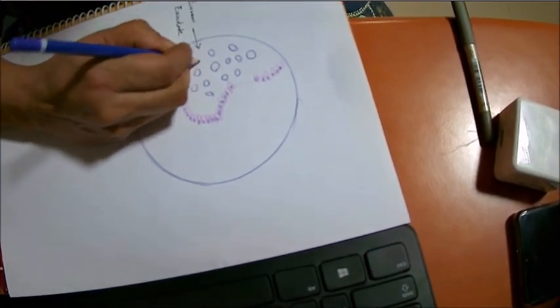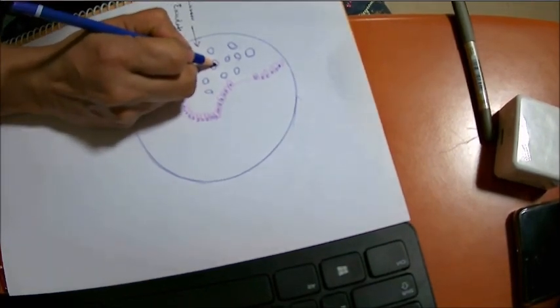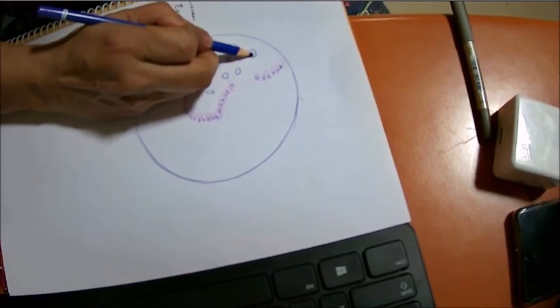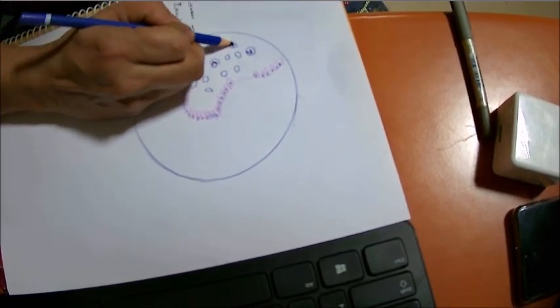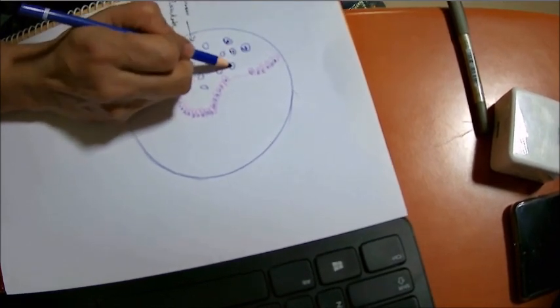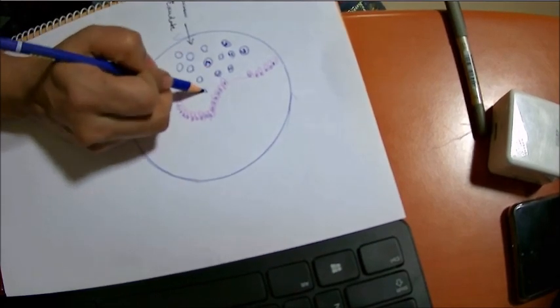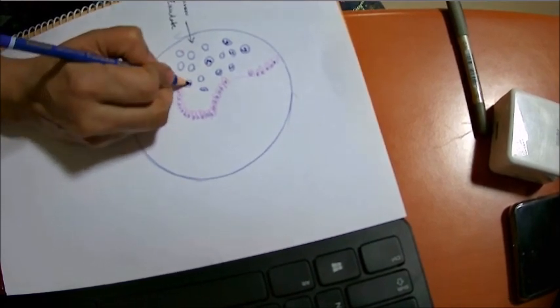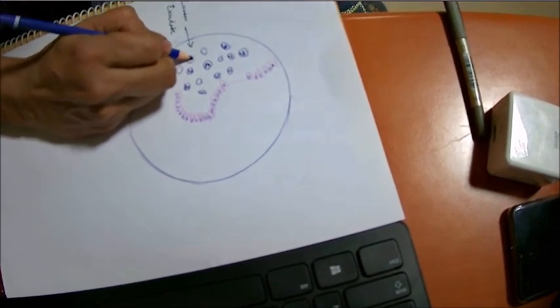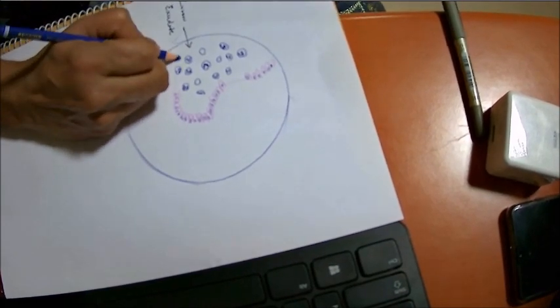I'll show you another way of drawing the neutrophils. You may use blue pencil itself, hematoxylin, fine. Those who have not taken hematoxylin and eosin, you can use blue and red. Okay, this nucleus is lobated. We always say ant-like nuclei. See, we're not drawing a single round nucleus. We are showing segmentation. That means we are depicting neutrophils.